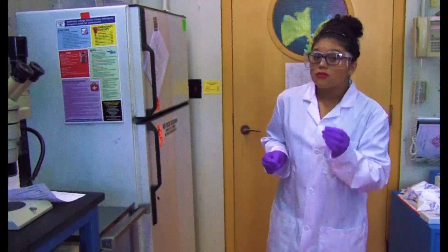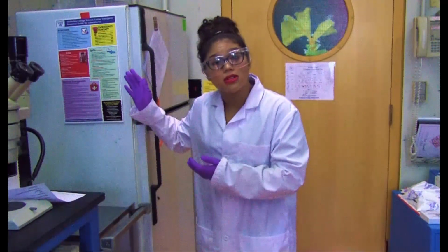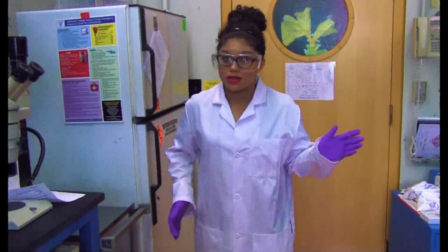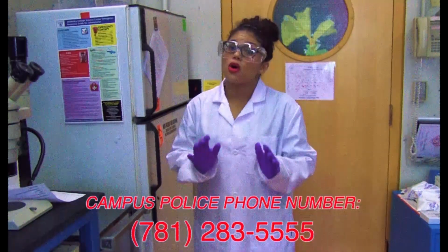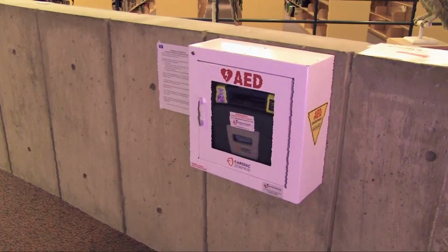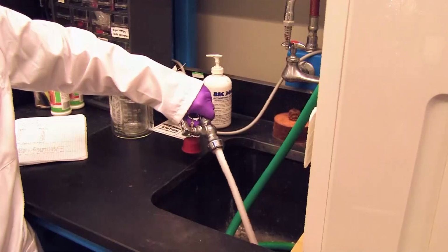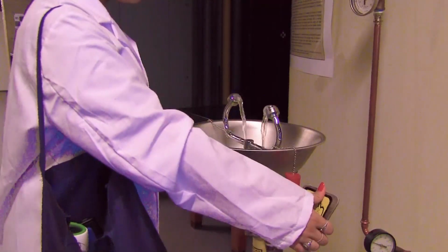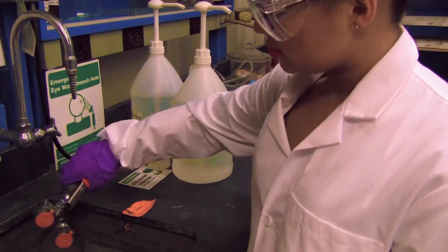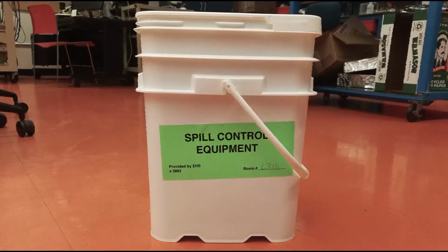For example, you need to familiarize yourself with the emergency poster located in every single lab. You need to know where the 2 exits are in every single lab. And you need to know Campus Police's extension by heart. There is an automatic external defibrillator, or AED, near the leaky beaker. You should also note where the nearest emergency eye wash, emergency shower, and spill kit is located. Here's a hint, there's always one nearby.